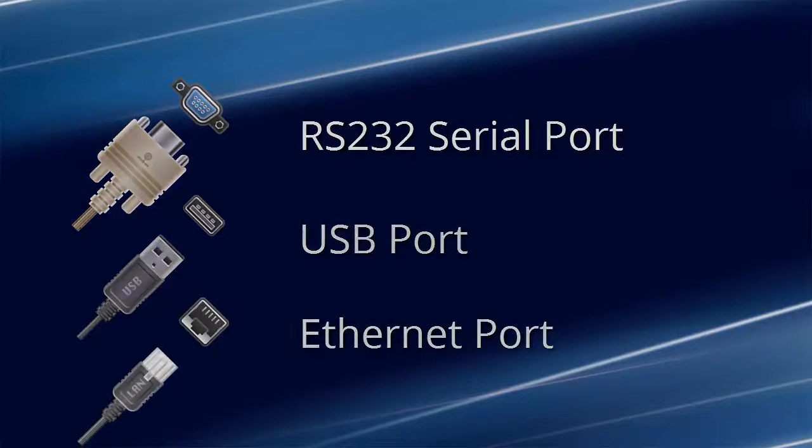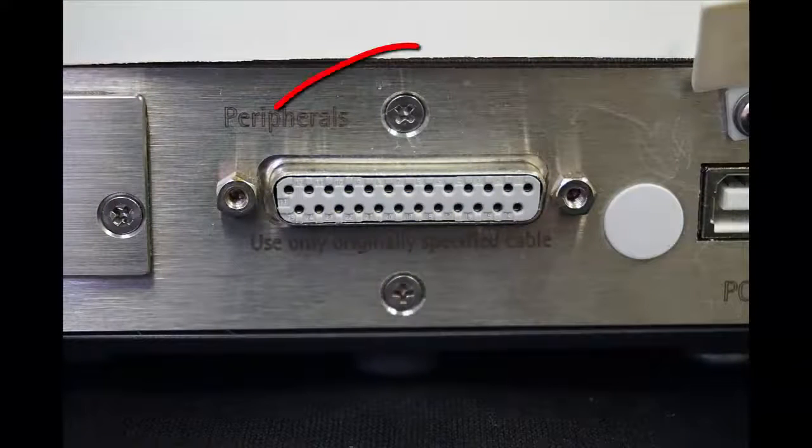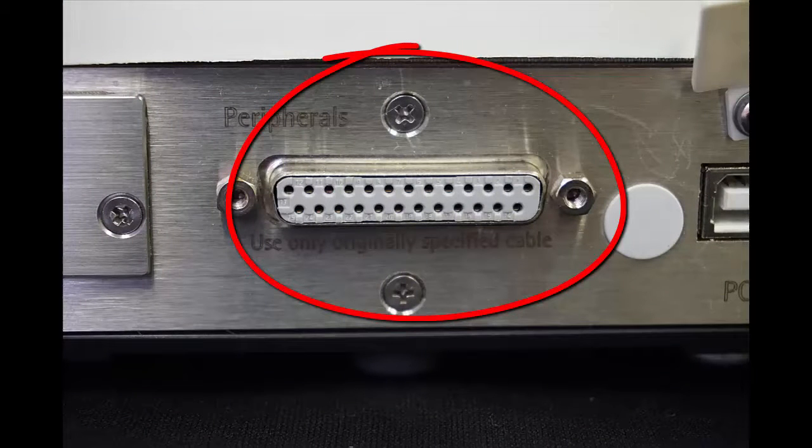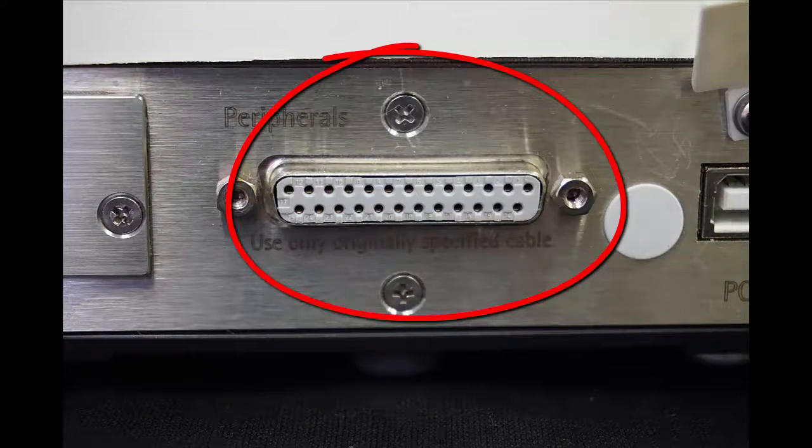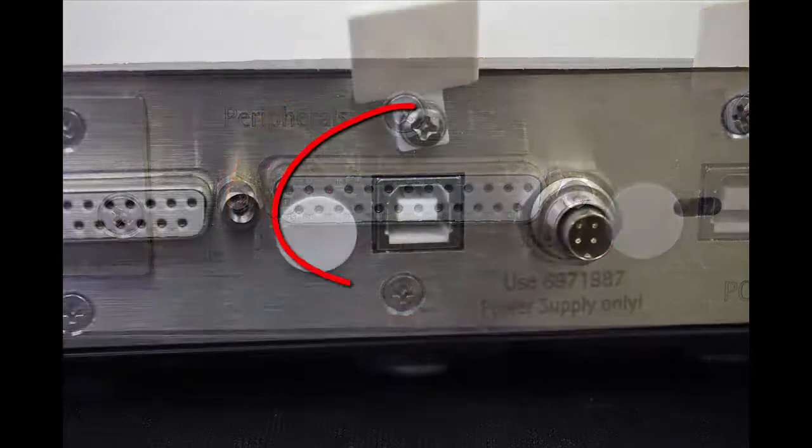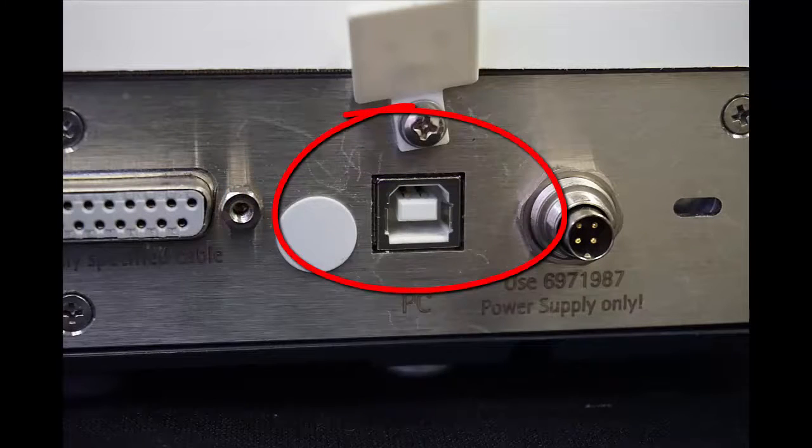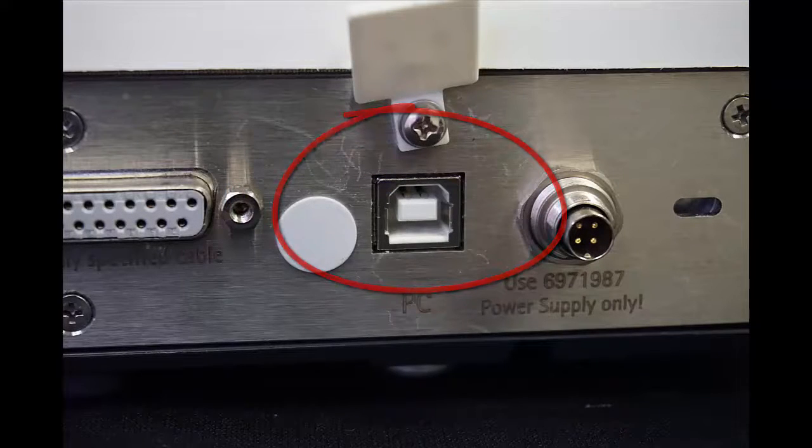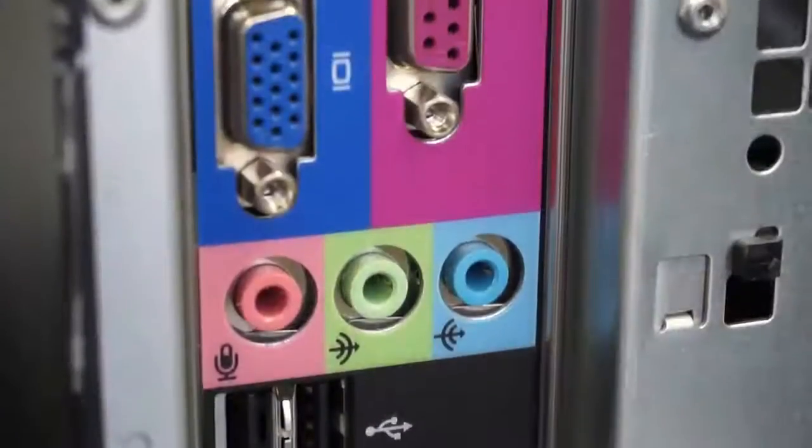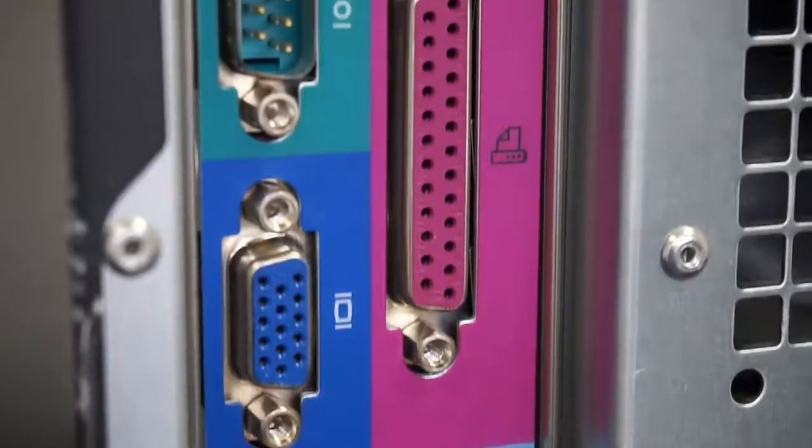Some models might also have an Ethernet port for connecting to a network, but I'll just be discussing USB and serial today. The RS-232 port on a Sartorius balance will have a 25-pin D-type connector, and the USB port will have a USB Type B connector.